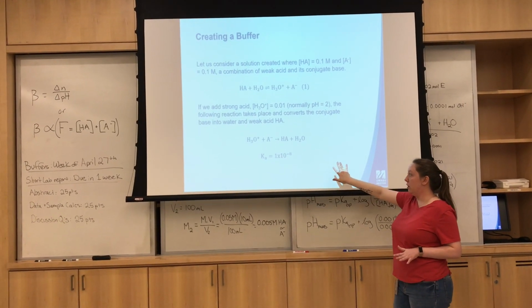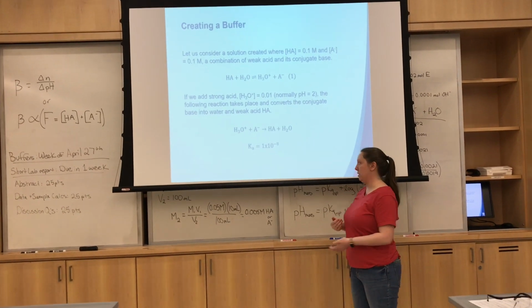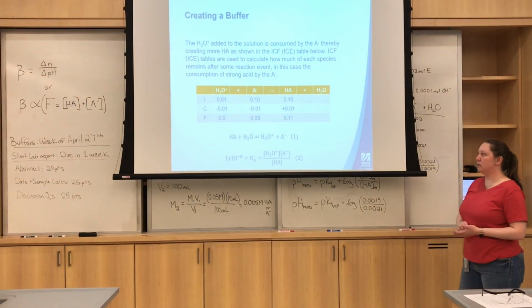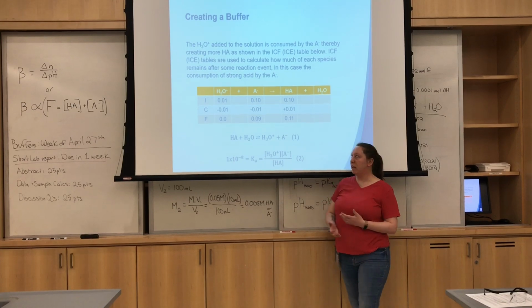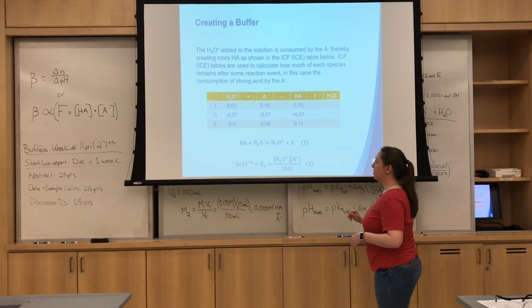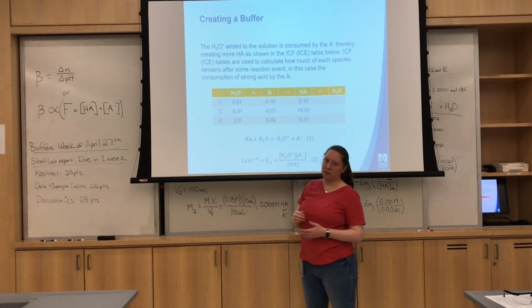Okay, so we want to see experimentally what is going to happen. Okay, so we can predict what is going to happen based on our ICE table. So we know what our initial concentrations of these are.